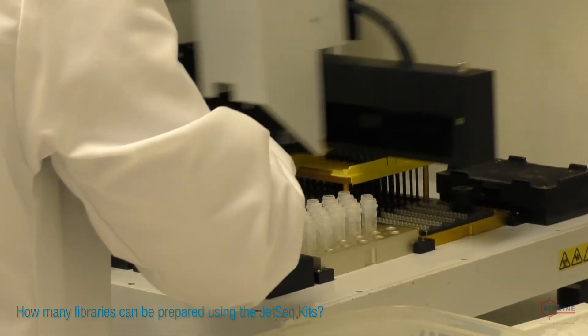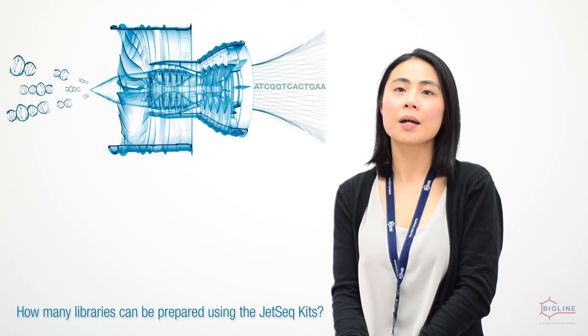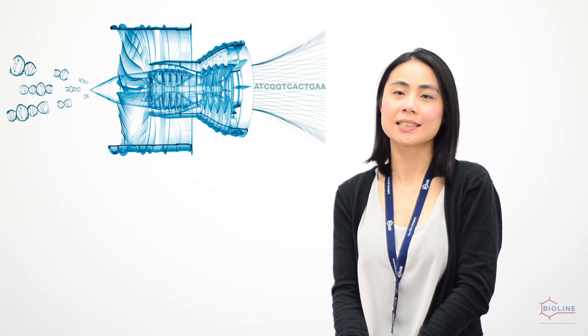The Gizzer Flexkit provides for 96 reactions, meaning users have the possibility to prepare one highly multiplexed library with 96 indexes, or prepare a single indexed library 96 times.